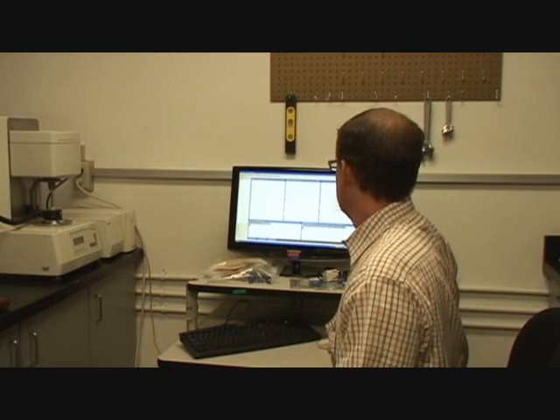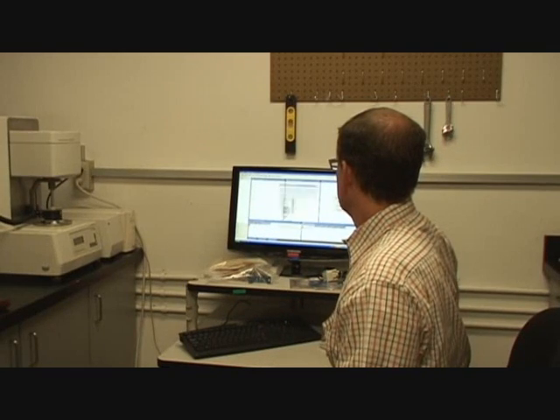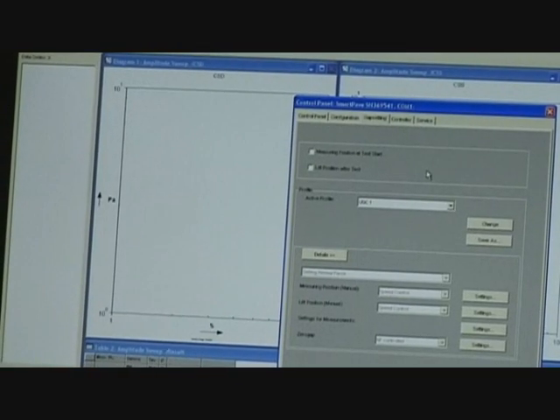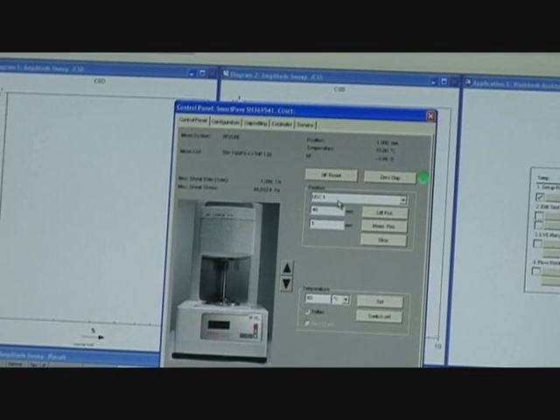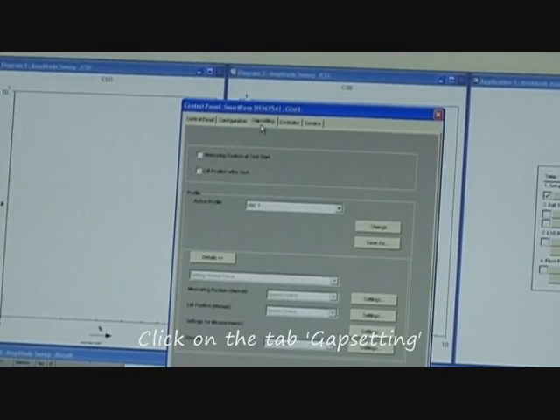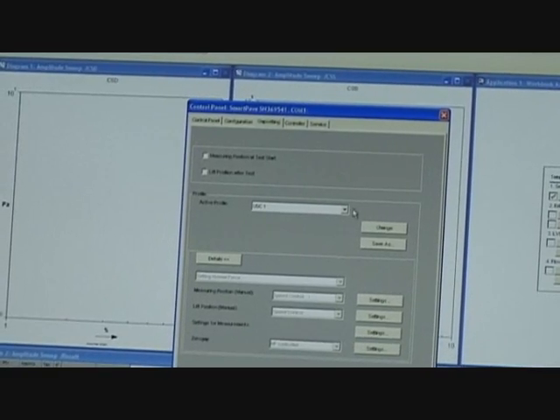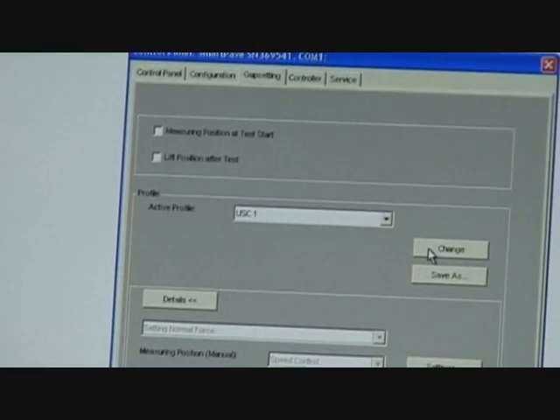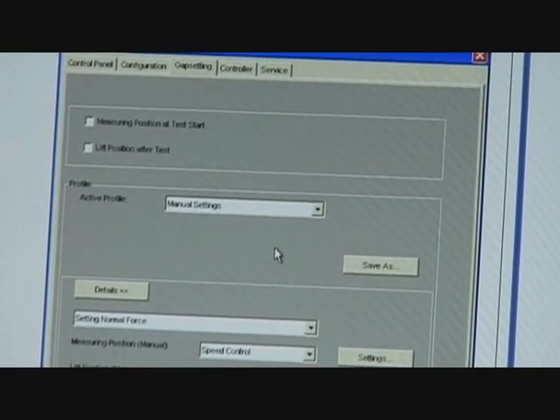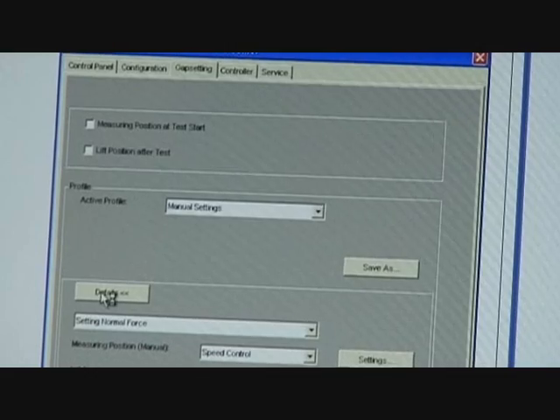And when you're running and it's softer, it should follow it. How do I do that? I tell it — we didn't talk about this yet — there's a way to do gap setting. The gap setting protocol I'm using over here is called USC1. Once I've set this up, you guys probably won't have to play with it too much. But I loaded it here. I click 'Change' — what that means is it loads them all into manual settings. When it's in USC1 it's in manual settings.